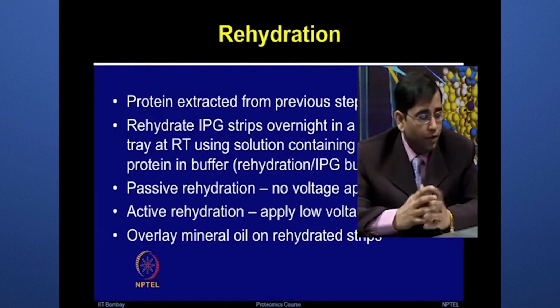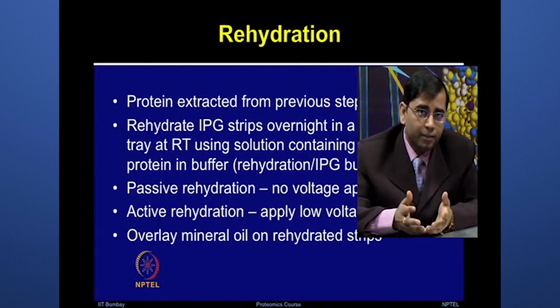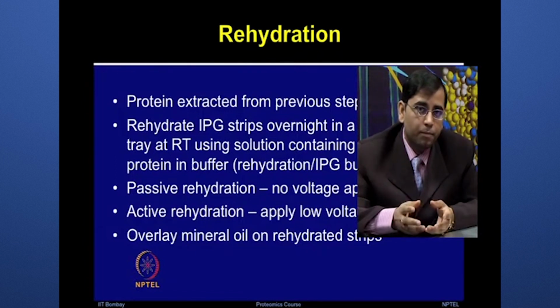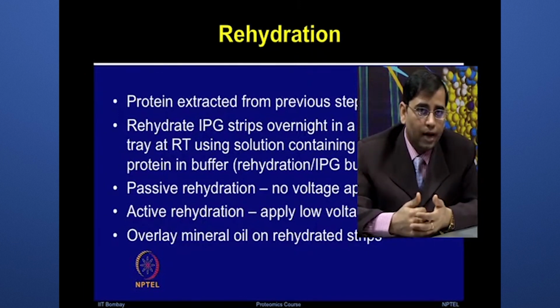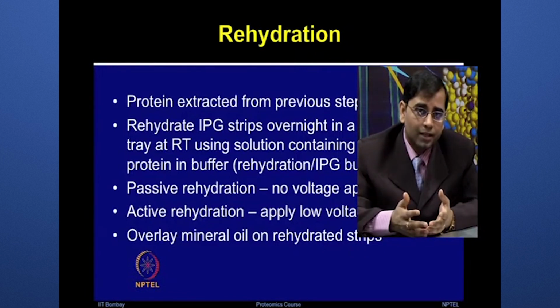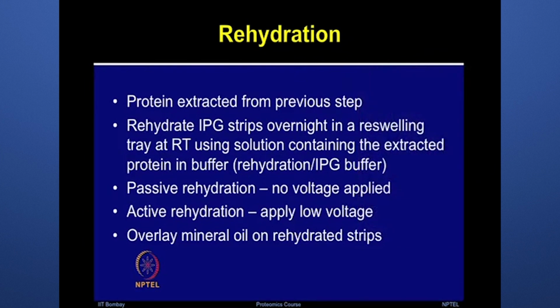Now, we have already discussed that none of these methods can be compared and said to be a superior method. One has to really use them on their own biological sample and see where the protein separation is better, based on passive rehydration or active rehydration. Once you have done the rehydration process, one can apply mineral oil to avoid any protein evaporation from these IPG strips.